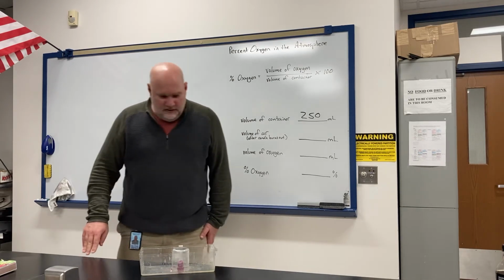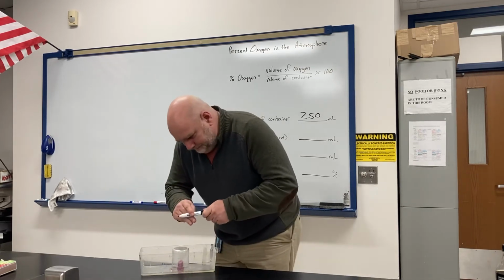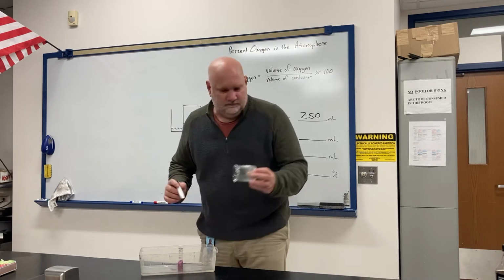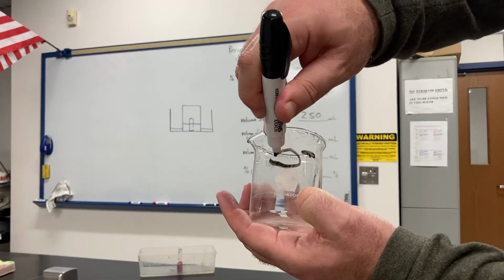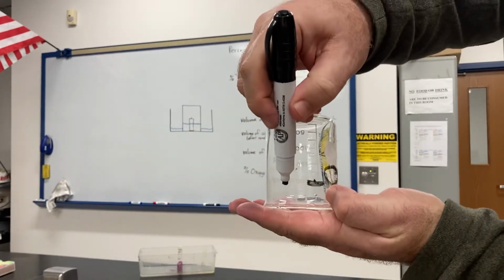Now, the beaker is a 250 milliliter beaker, but when I put it in there like that, the water went up to the 200 line.